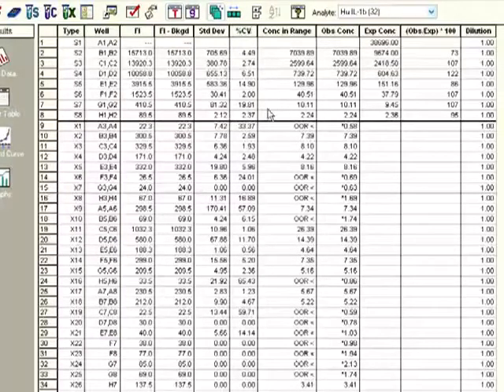Typically, good percent CVs with this kind of an assay are below around 20%. Sometimes in the 20 to 30% range would be acceptable. Anything above 30% would start to be questionable. And you can see that typically values that are high are a consequence of very low concentration values, which are very close to the limit of detection of the instrument. So the closer you get to the background, essentially, the higher the percent CV, and this usually makes sense. That's normally the way things work in pretty much any assay. As you get closer to the background, the variability goes way up.